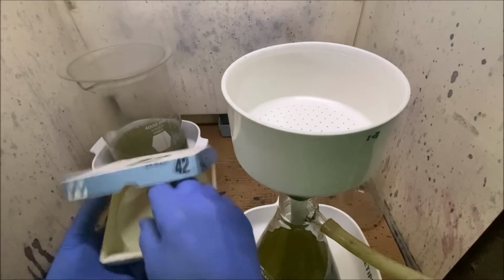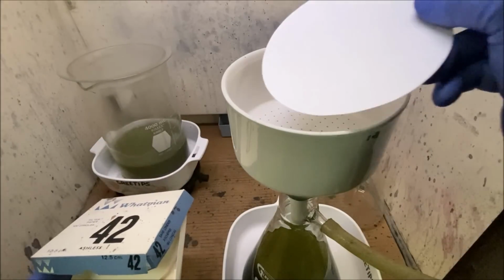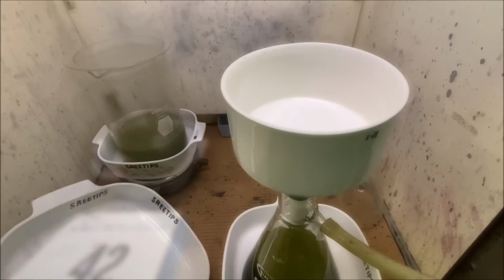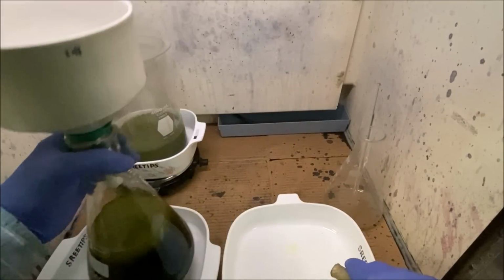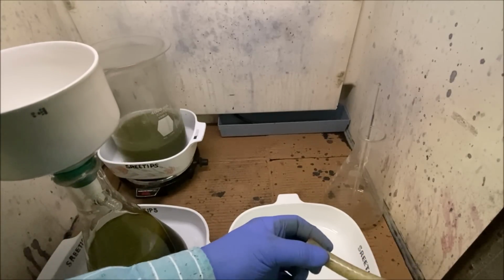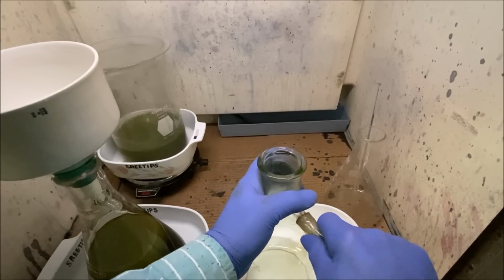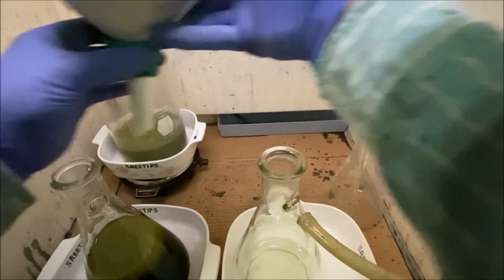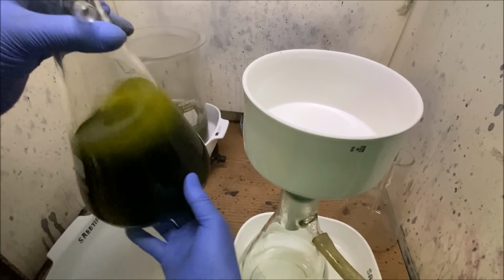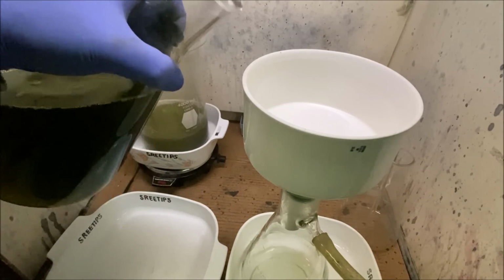We'll rinse our funnel out real good with some distilled water. I've got a number 42 Whatman filter here. Add that to our funnel. Alright, we're going to take this filter flask, put it over here. Bring up a clean filter flask. Transfer the funnel. Refilter this solution that we've recovered through a new filter. Here we go.